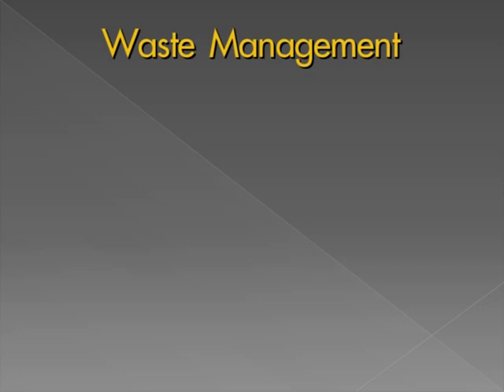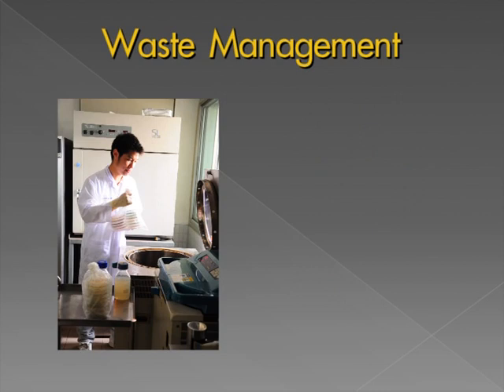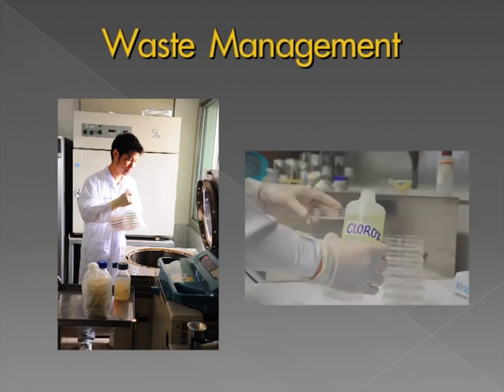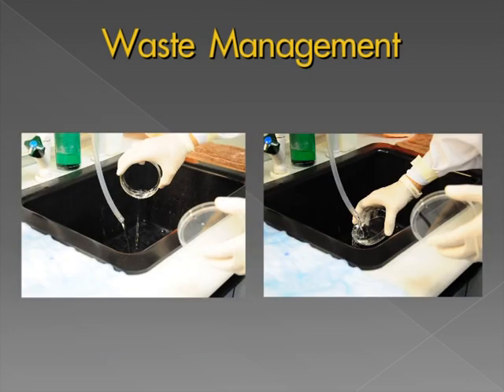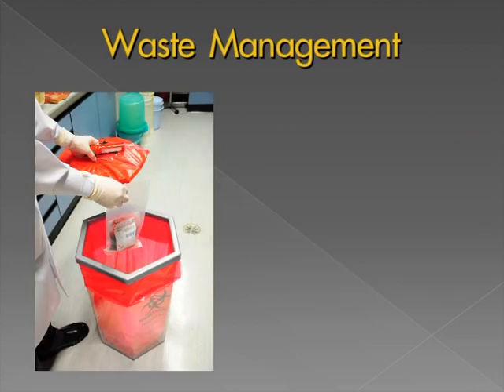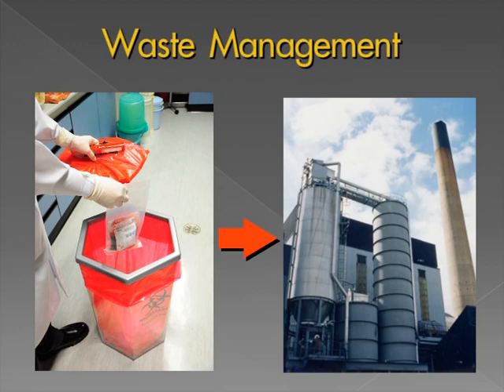Waste management. Many biohazardous materials will grow if left to their own devices. For this reason, biological wastes should be disposed of quickly and shouldn't be kept around for more than a few days. At CRI, biohazardous waste is either autoclaved on site or treated with disinfectant on site before being discarded in the general trash, or discarded in the biological hazard trash to be picked up by a contractor and incinerated.